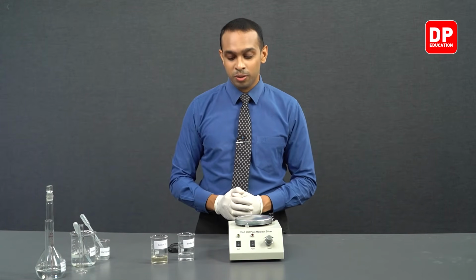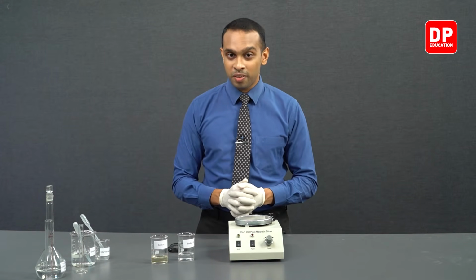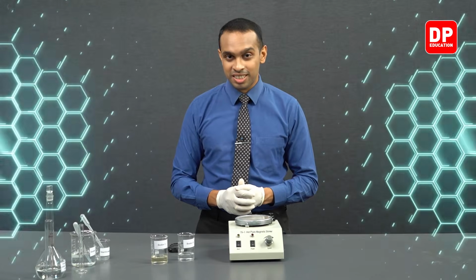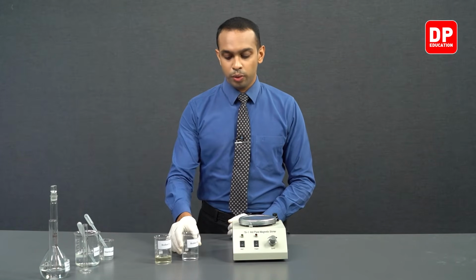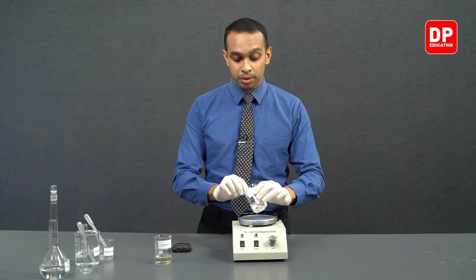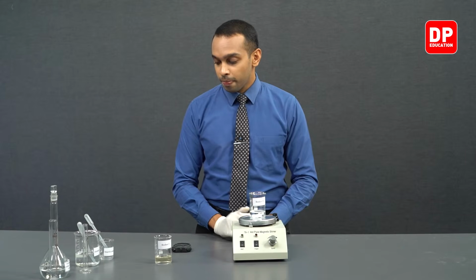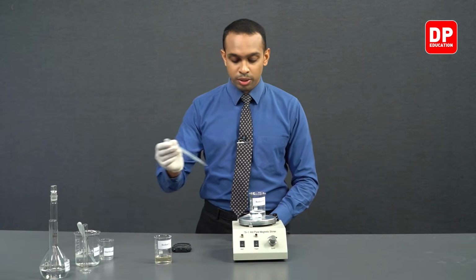Now students, all that we have left is to add these two together and start our reaction. So we will place our beaker 2 on the magnetic stirrer, and we include the stirrer bar there, and then we can add our starch solution as well.